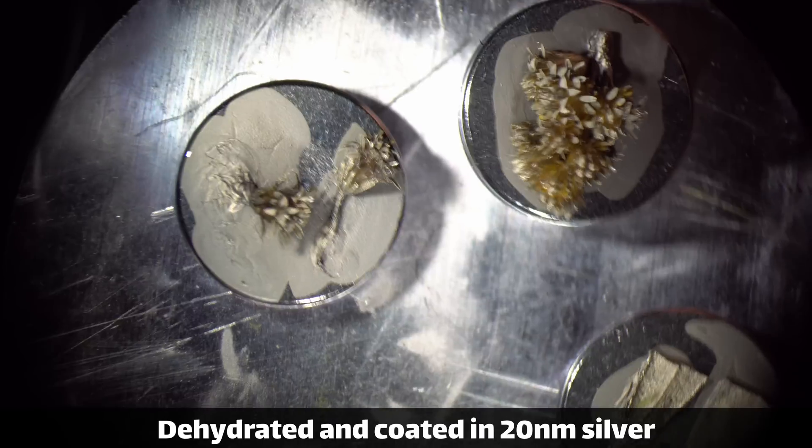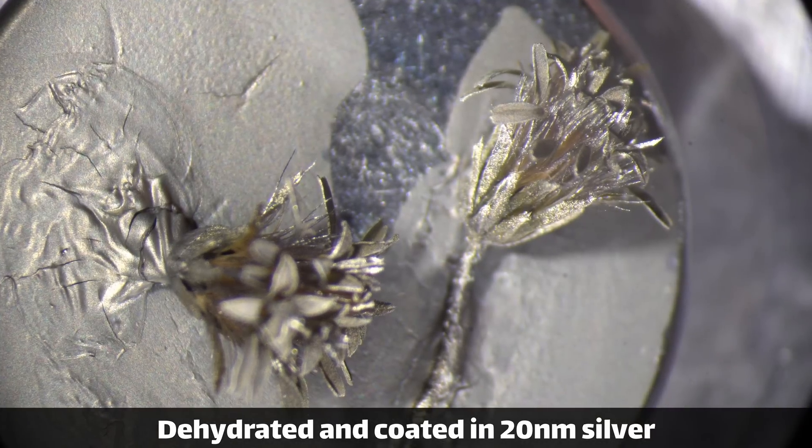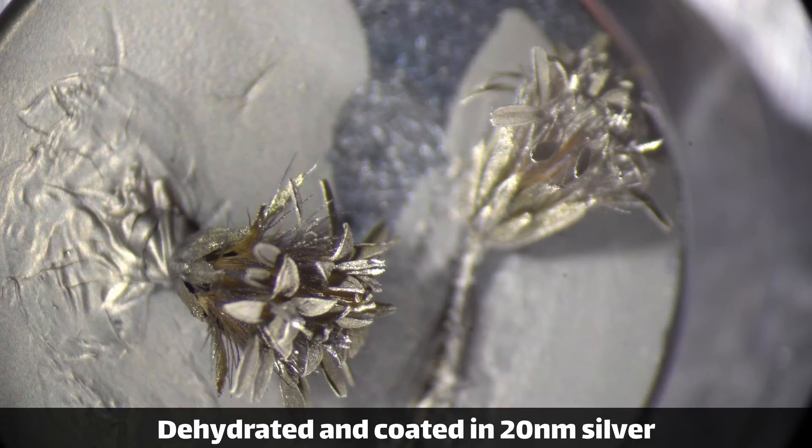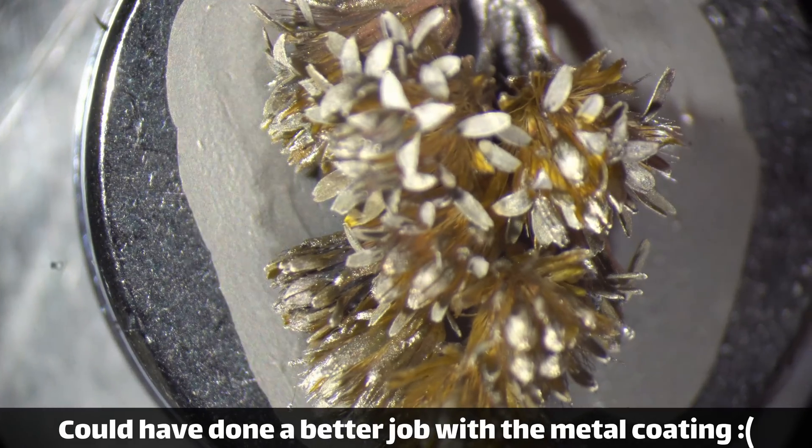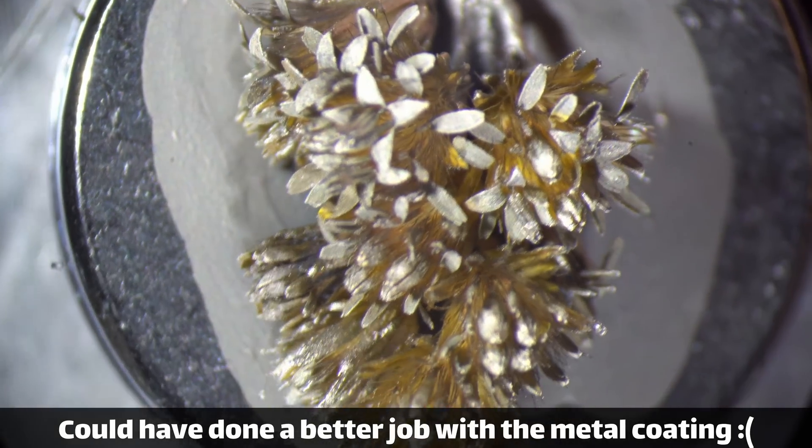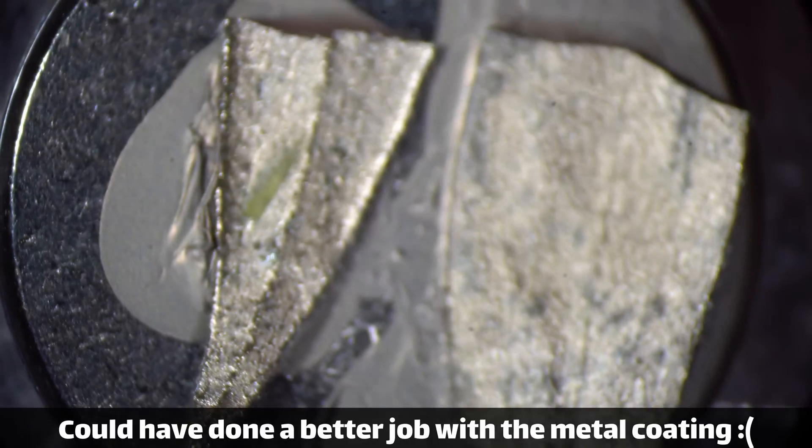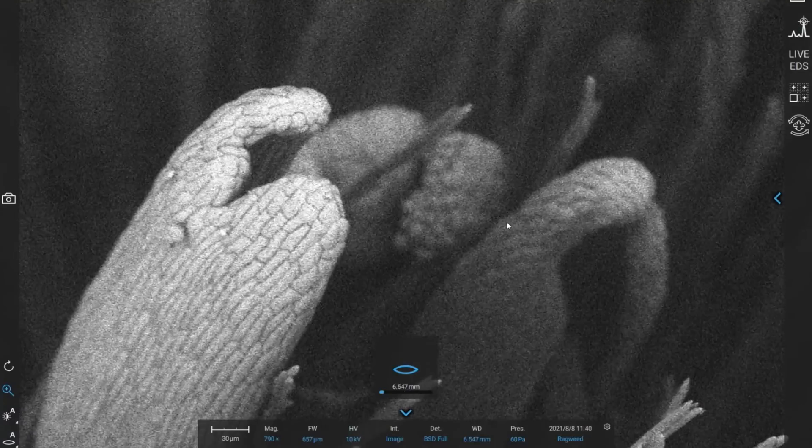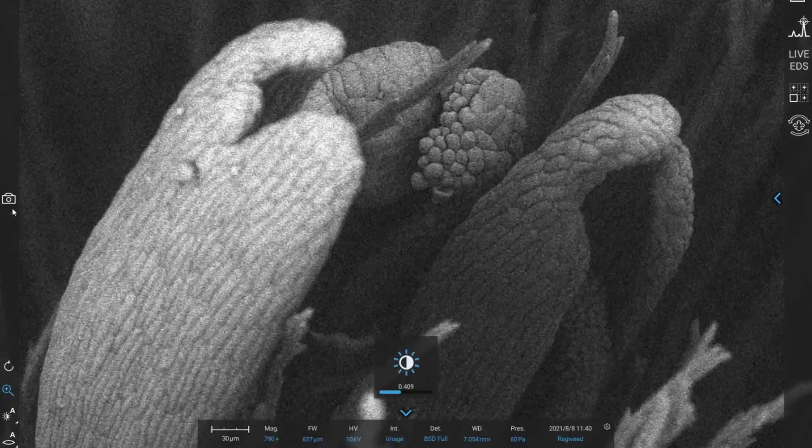These arise from how the sample is prepared for microscopy. You see, a scanning electron microscope operates in a vacuum. Samples have to be fully dehydrated before they can be placed into a vacuum, and are often coated with a thin layer of metal as well. Different preparation techniques preserve or distort different aspects of a sample. My method of choice, dehydration and fixation in methanol, followed by freeze drying and tert-butanol, does an acceptable job, but it isn't perfect, as seen in some of the images.